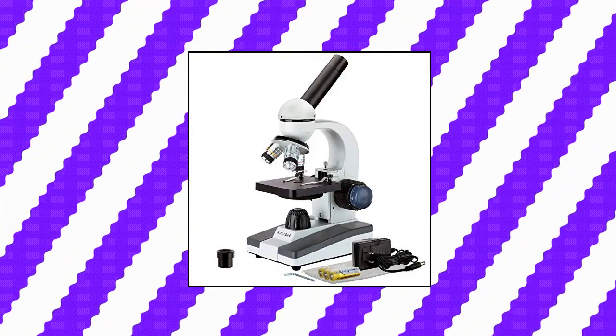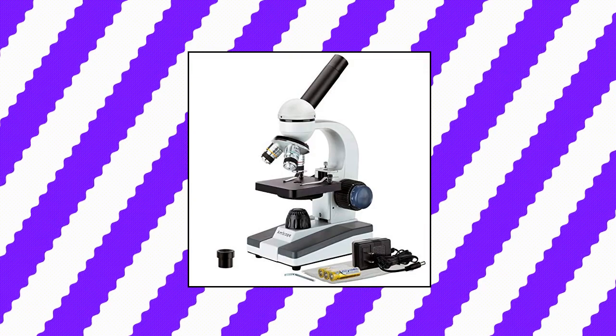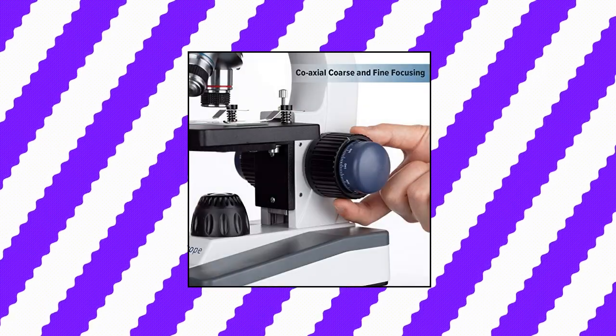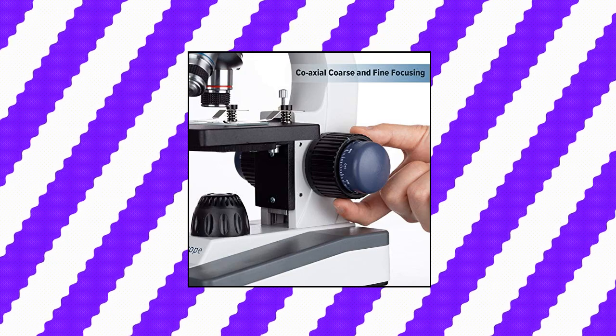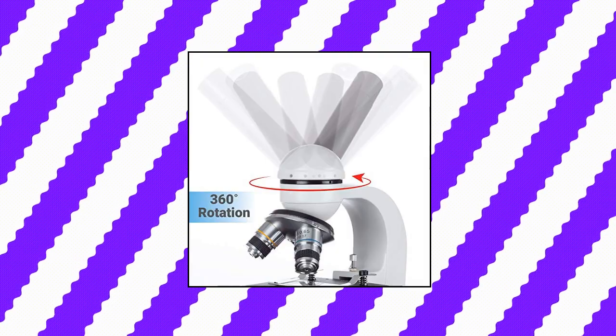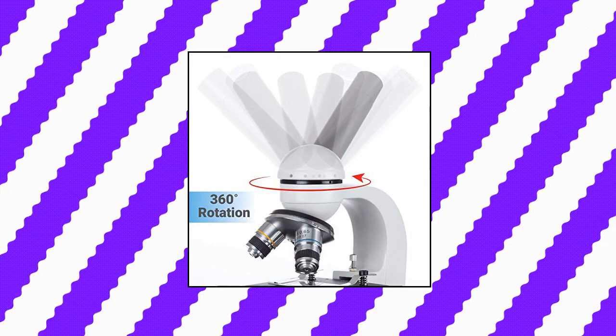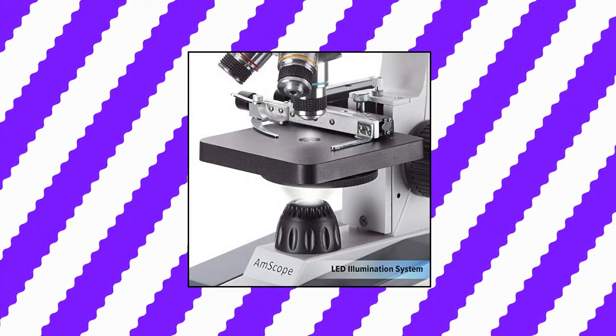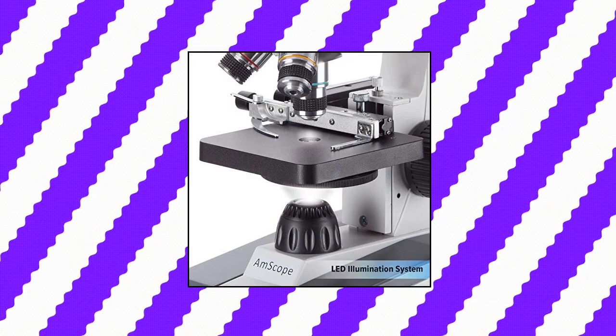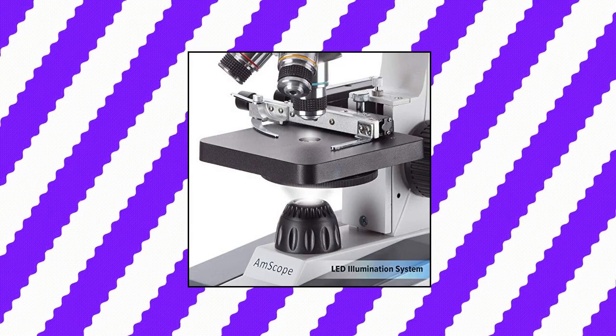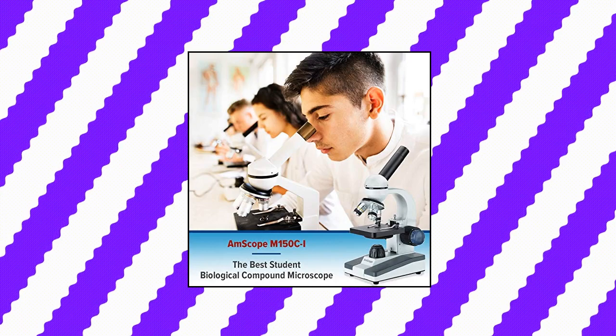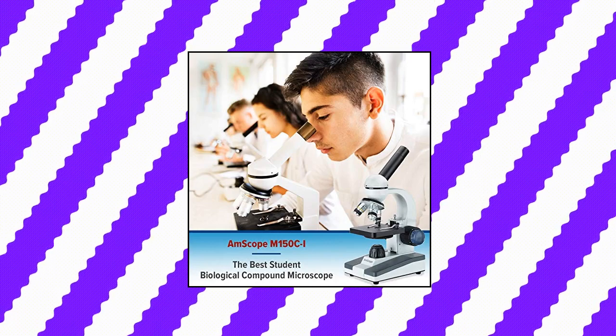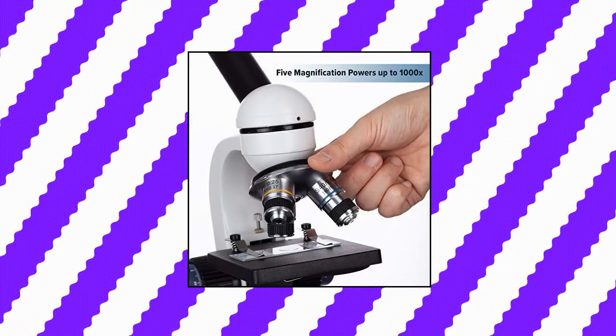M-Scope M150C 40x-1000x All-Metal Optical Glass Lenses Cordless LED Student Biological Compound Microscope. This is an ideal microscope for home school or for students in elementary to high school to learn sciences. 360-degree rotatable monocular head offers five magnification settings: 40x, 100x, 250x, 400x and 1000x. Wide-field all optical glass elements includes single-lens condenser with disc diaphragm, sturdy all-metal framework.